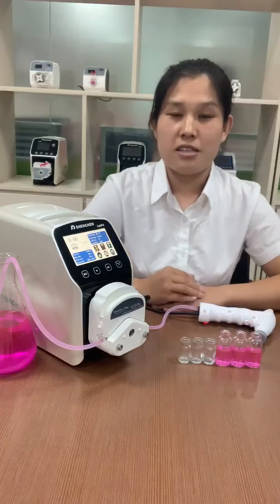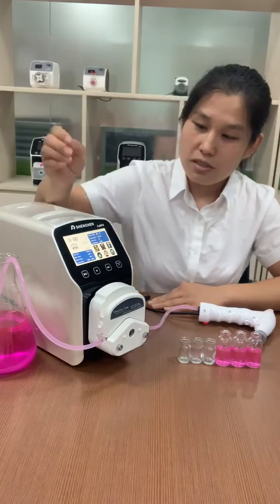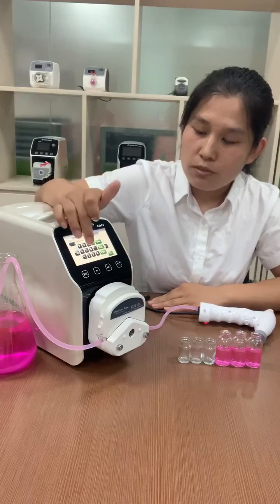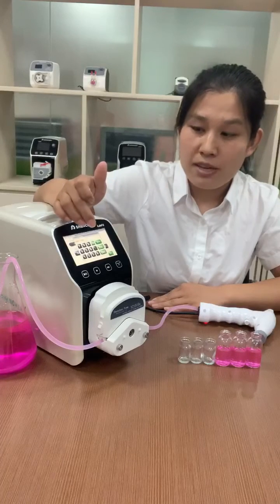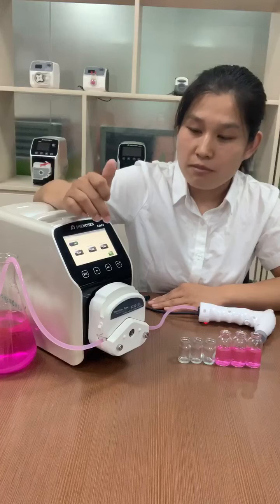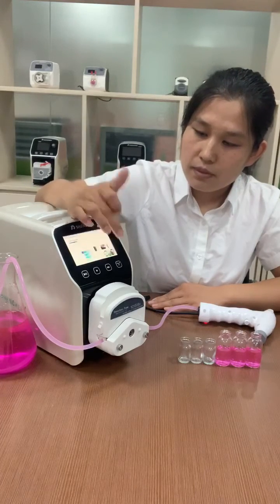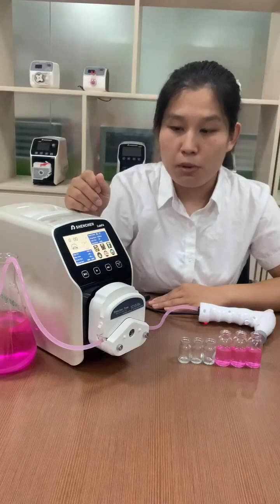Now we can change the filling volume to fill these small size bottles. Filling volume: 5 milliliters, runtime one second, and pause time one second. This time we can set the repeat numbers to three bottles.